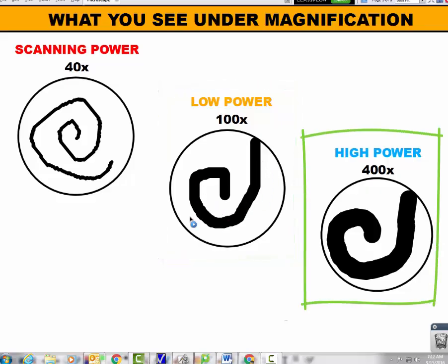And then when we switch to 400 power, 400 power is going to again zoom in even further, blow the object up even bigger, allow us to see more detail than we normally would see.